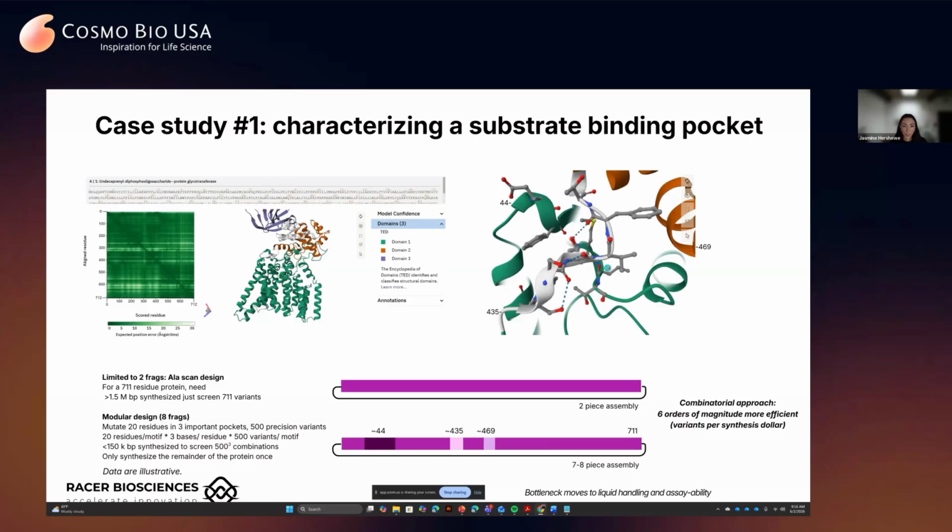that all participate in this binding. So if you stretch that out across the sequence, you can see that you may need to actually change multiple modules at a time. And with tools like AlphaFold, so I'm showing you the AlphaFold prediction here on the left, this type of analysis is becoming more and more common to be able to do at your computer without a crystal structure.